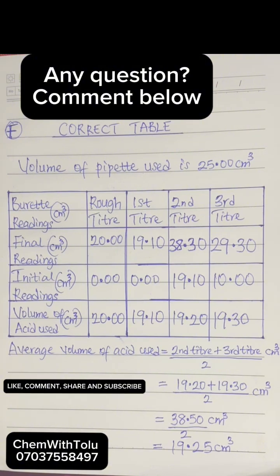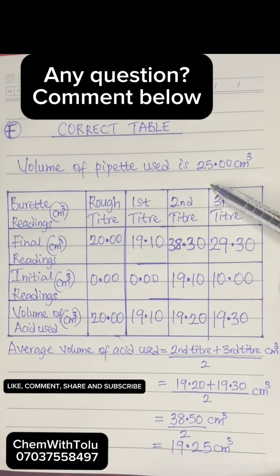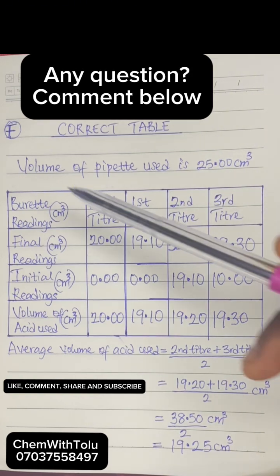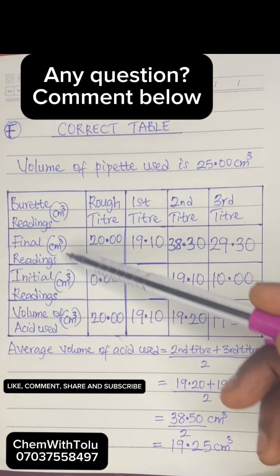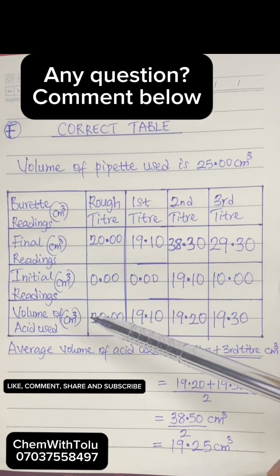Now, if you look at the table, first thing is you have your volume of pipette used, which is 25 point, it must be in 2 decimal places, 25.00 centimeter cube. And then next thing, in your table, you put your unit, centimeter cube, to all of your burette readings: final reading, initial reading, volume of acid used.